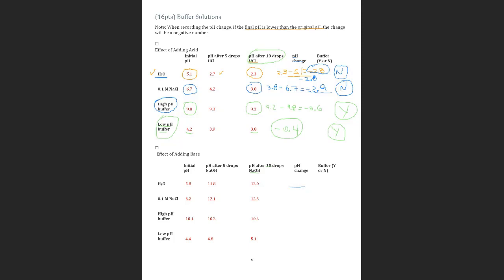Yes, exactly. Now it's positive. That's a lot of change, 6 points. Are we in the presence of a buffer? No, very good. Same here, you completed. And how about the low? Let's do the high pH buffer. What is the pH change?